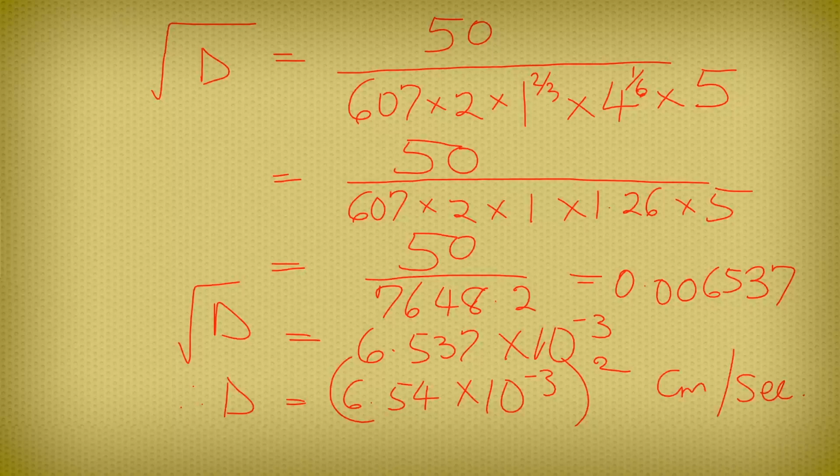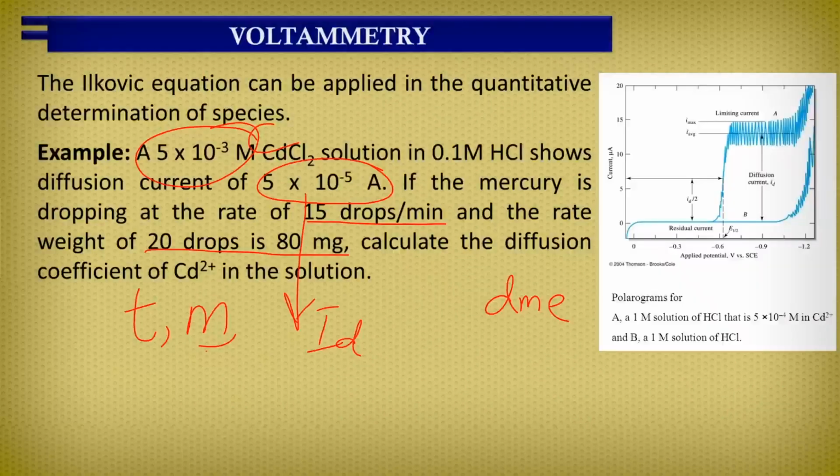Thank you. So that is how you get your diffusion current using polarography. Now this is the problem we have solved.